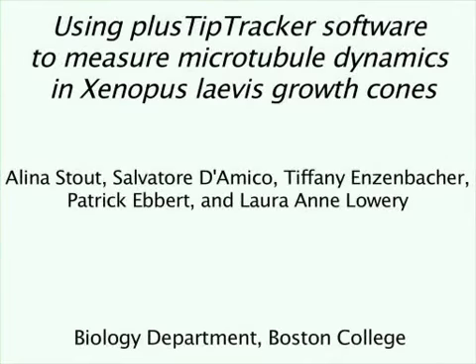The aim of this procedure is to obtain quantitative information regarding microtubule plus end tracking protein, or plusTip dynamics, in living growth cones using the software package plusTipTracker. Here, we describe the steps for analyzing images of EB1 GFP dynamics in cultured Xenopus laevis growth cones, but a similar protocol can be used for other cell types.